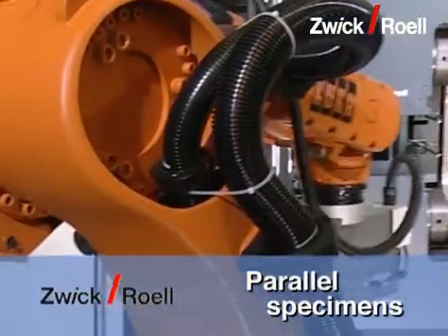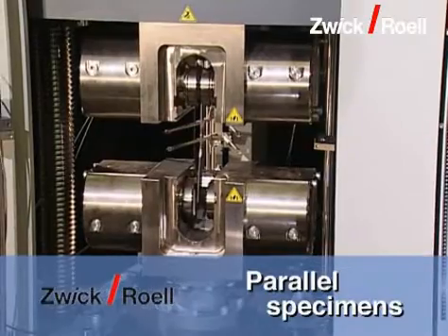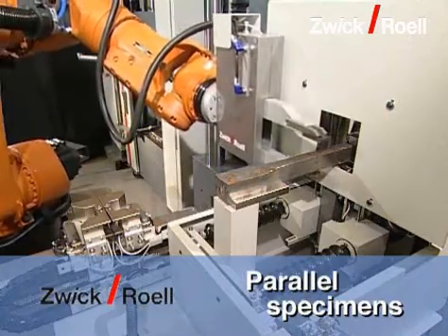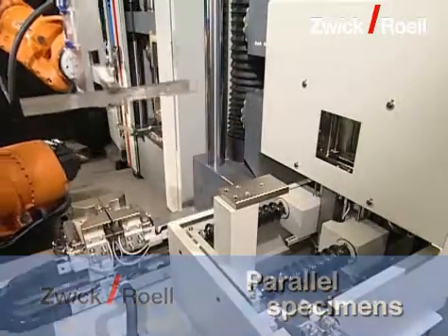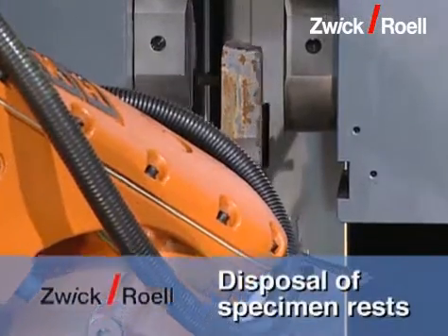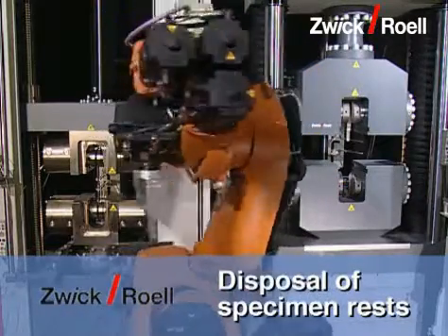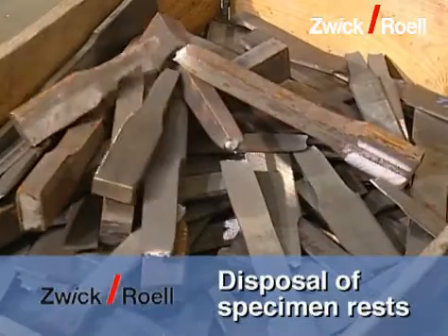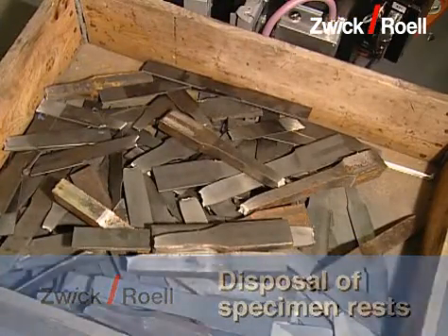Several specimens are run in parallel within the system. In extreme cases, one specimen can overtake another within the system. This has a positive effect on the rate of tested specimens. The criteria for the disposal of the specimens can be defined independently — for example, specimens can be sorted into different boxes depending on their tensile strength.